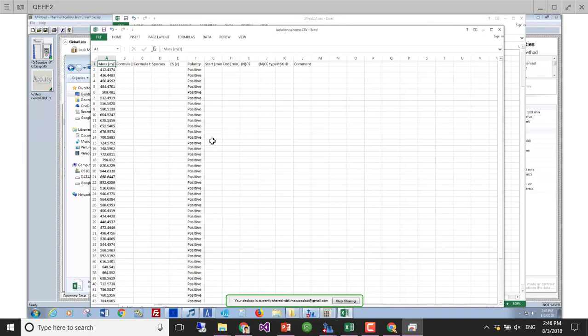Cool? OK, any other questions about QEs or how to set them up for this sort of thing? The one thing I haven't shown you how to do is variable width windows, and that's because it's really hard on a QE. It's just not well designed for it. It's much better designed on the swath instruments to be able to set that up. You can do variable width windows. It's just hell to organize the instrument to make it go. OK?